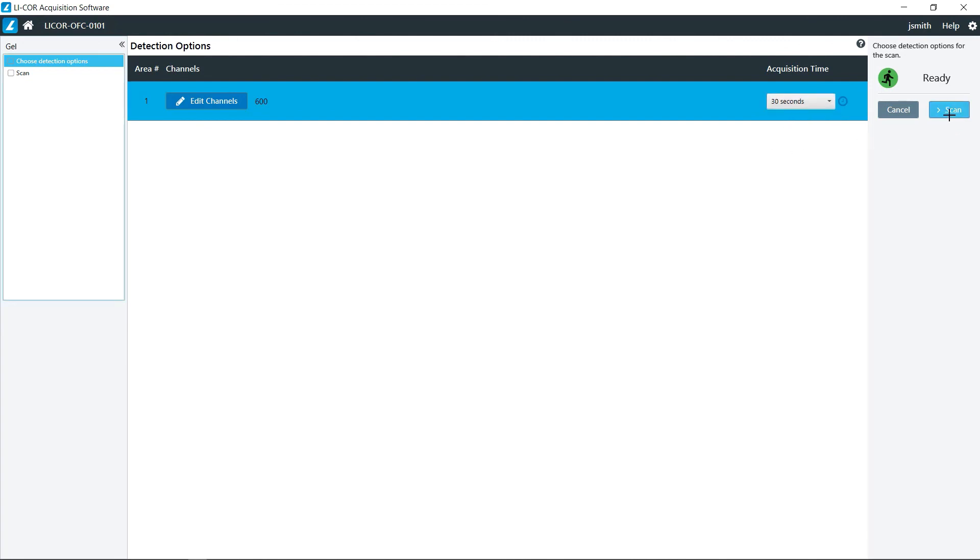And then again, you click start scan, wait for the image to be collected, and then export it for analysis in Imperia. Thank you.